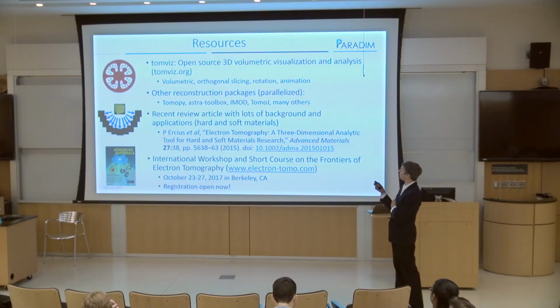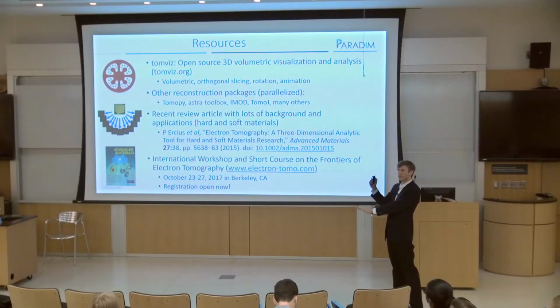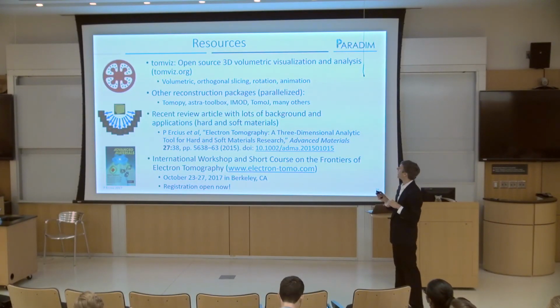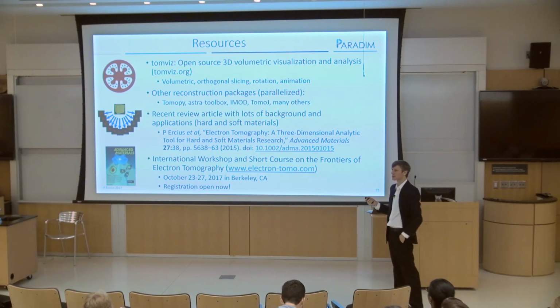And then I just want to also put up some resources. So if you want to know a lot more about tomography, I only had an hour and 15. I think I'm right on time. There's so much more to know, and I went through a lot of stuff maybe a little bit fast. But TomViz we're going to talk about later. There's many different reconstruction packages that you really want them to be parallelized. It's embarrassingly parallel, so you can get a reconstruction relatively fast.